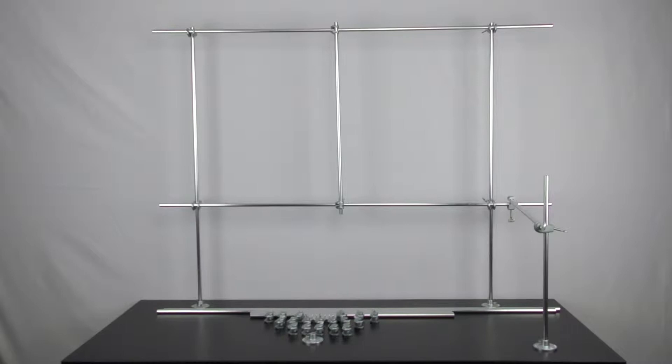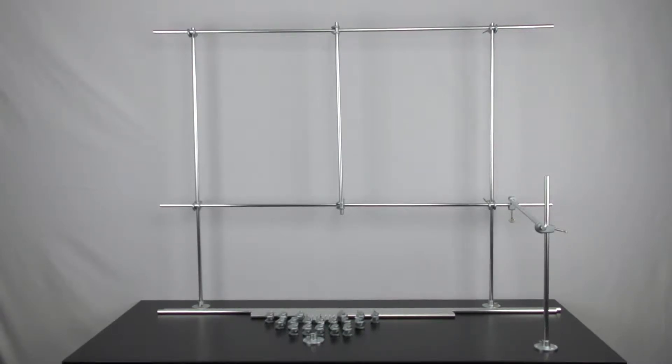The Lattice Support System is a fully customizable support system for your laboratory needs. There are multiple sizes to choose from and each one can be mounted easily to your existing lab or bench top.